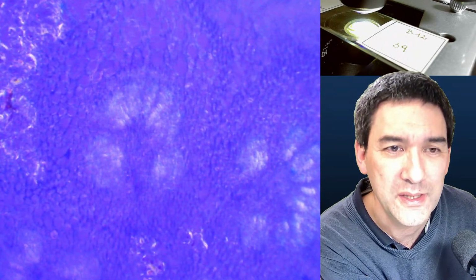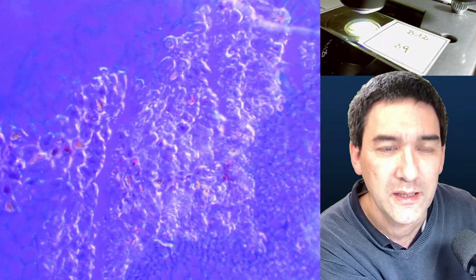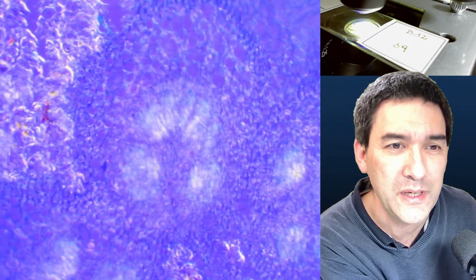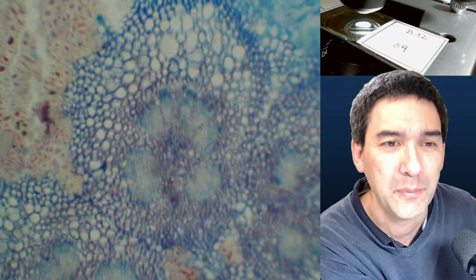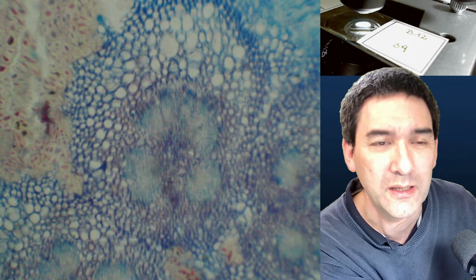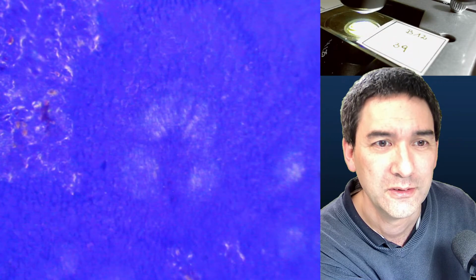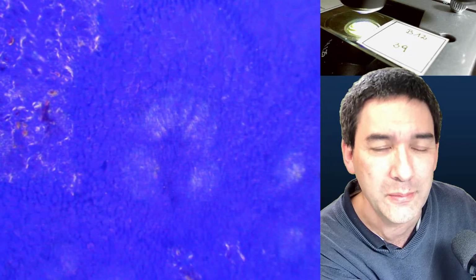And what they do is they seem to refract the light much better than the other cells, and that's why they appear to be brighter than the other cells. And that is something that we're able to see in Rheinberg and also in dark field, but we're not able to differentiate that so much if we just open up the condenser. Then basically we see everything here, right? But those cells which are now in the center, they do not shine up. So when you're now using the filter, then you see that they appear to be brighter, because I think of the thicker cell wall, they're able to reflect the light better.